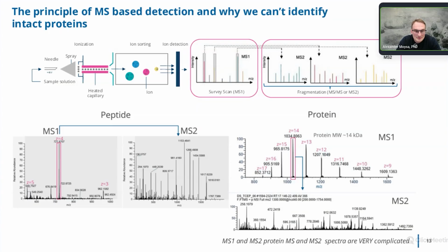Protein identification in a proteomics experiment using mass spectrometry is based on peptide identification. Peptides are identified based on their mass and fragmentation spectra, a combination that is nearly unique for each peptide. Therefore, mass spectrometry data typically include mass spectra of peptide ions and their corresponding fragmentation spectra.